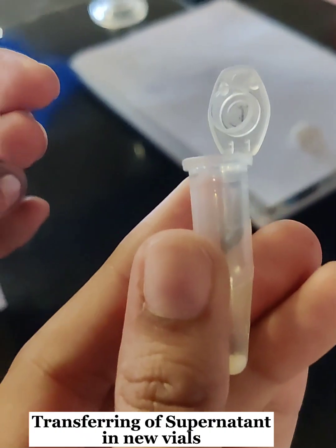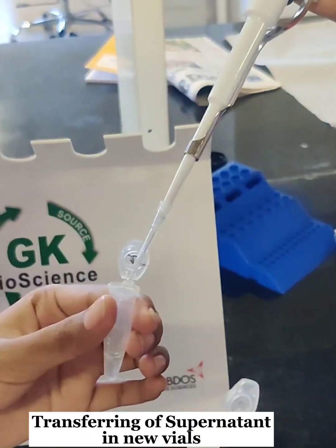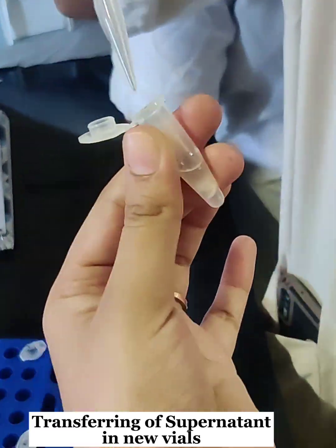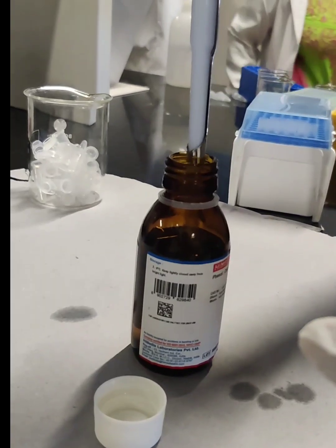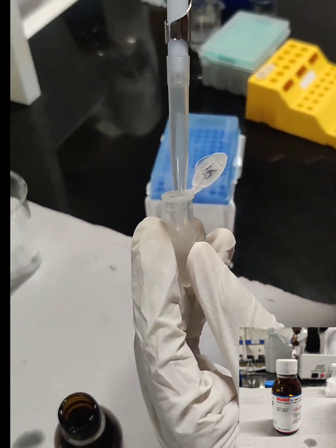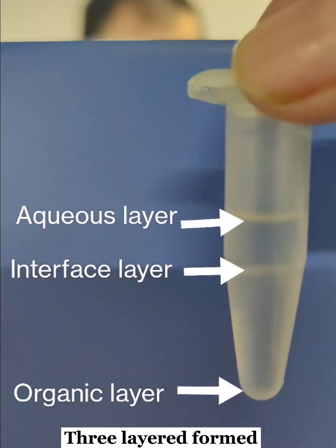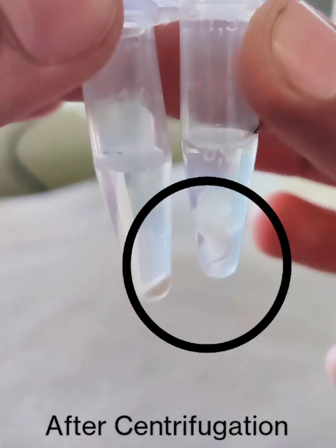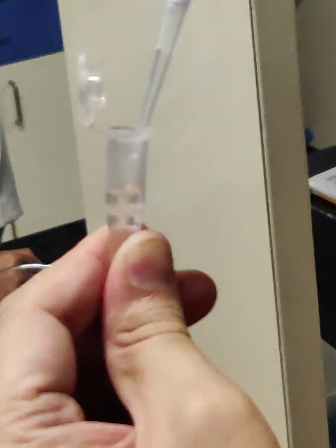We then centrifuged the tubes for five minutes. After centrifugation, the supernatant was transferred to new vials. We added phenol-chloroform equal to the amount of supernatant, mixed thoroughly to get three distinct layers, centrifuged the vials, and carefully removed the supernatant obtained.